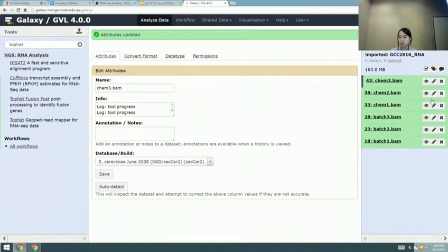So here's an example of an exon-intron boundary. As you can see, the reads have been spliced out here, and this intron is actually from this splice variant. This over here is the junction track that TopHat has outputted.